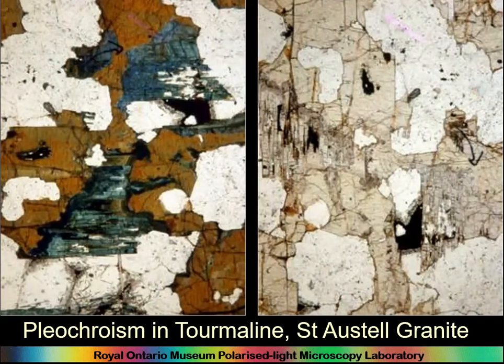And there's tourmaline, which is possibly one of the coolest types of absorption, because this is called dichroic quite often. In this case, you could only see 2 going on. It's blue here, and you rotate the stage, and this is it over here, and it's almost colorless. So you can see this bluish change is really quite distinct.